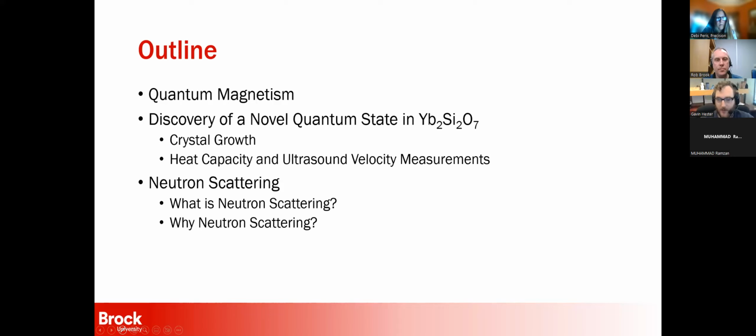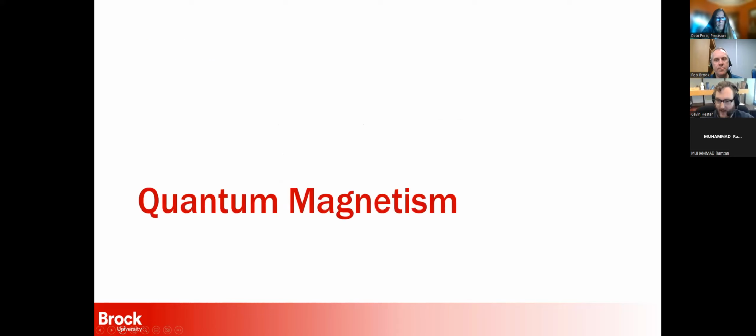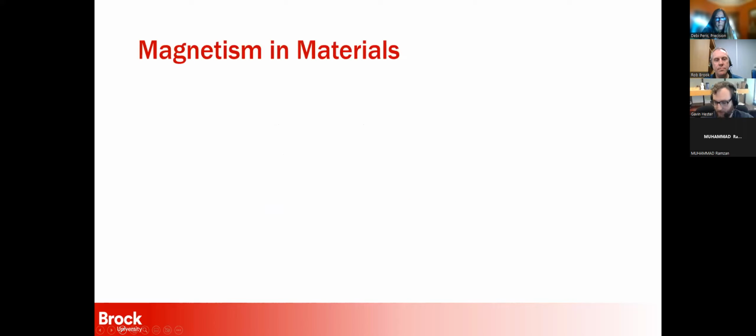I'll discuss why we would use neutron scattering, and then finally I'll show you some results we got on ytterbium silicate, and tell you a bit of an interesting story that does involve the Photonic Sciences Laue that I was using. So with that, let's jump into quantum magnetism.